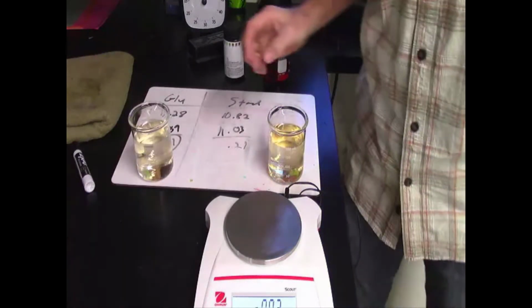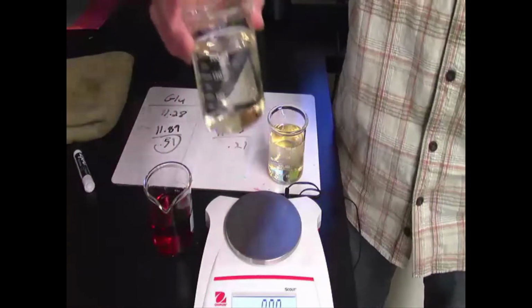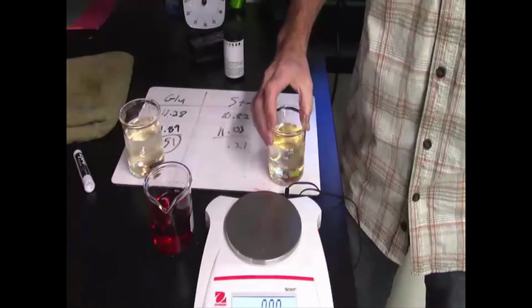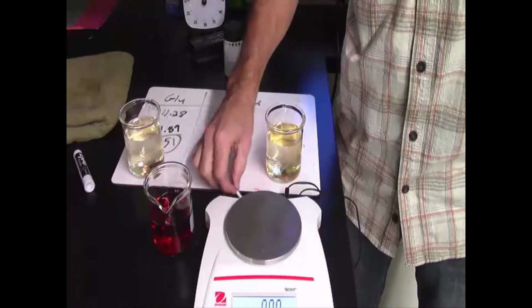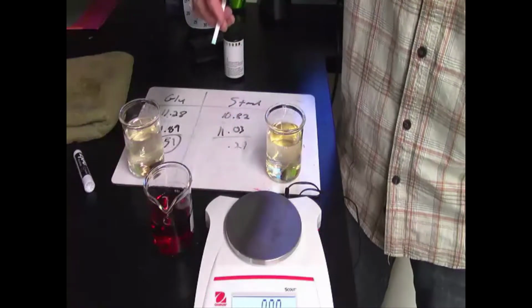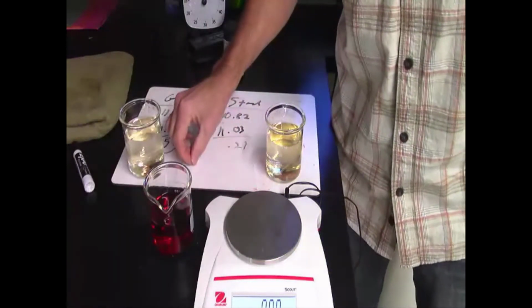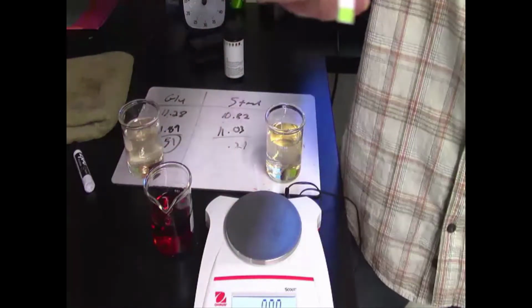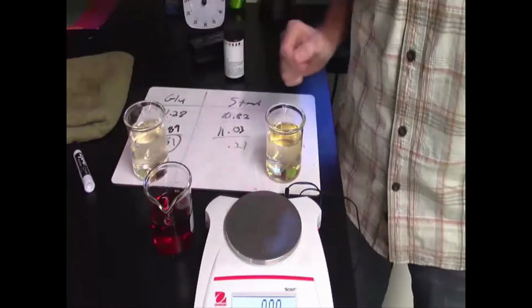Okay, it's been a couple minutes, and for the starch test results, I don't see any blueness there anywhere. Starch test here, nothing. I do see that the glucose test around the starch cell is still a negative. And there's a little bit of glucose that is leaking out of this bag over here.